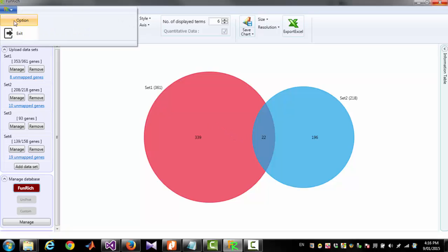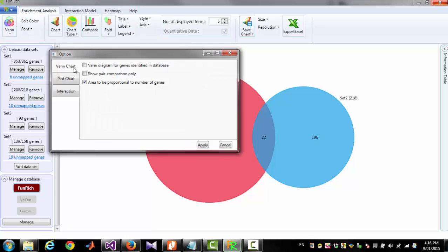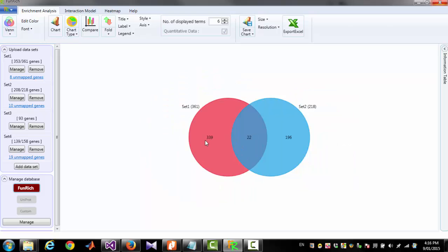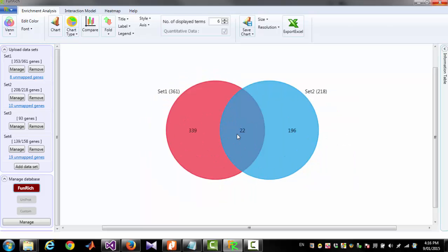If you want the circles to be equal, click option Venn Chart and uncheck this checkbox calling area to be proportional to number of genes. Then apply. Now you can see both circles are equal.